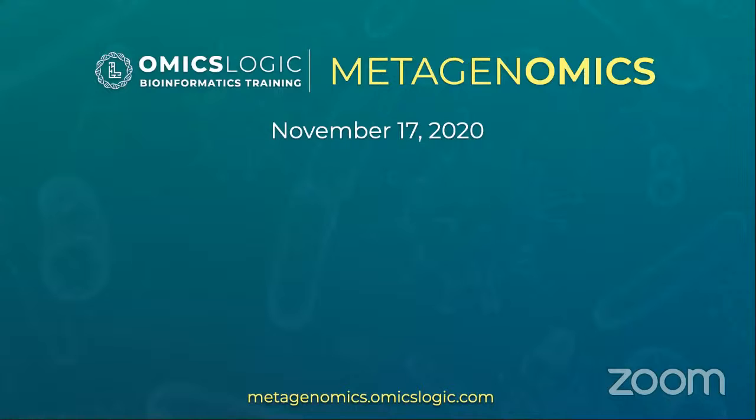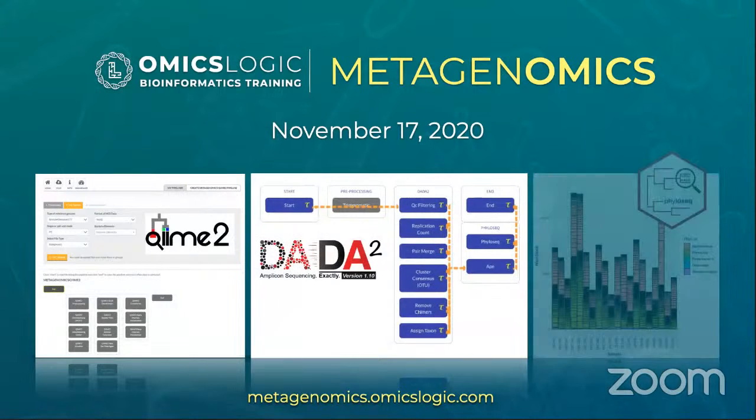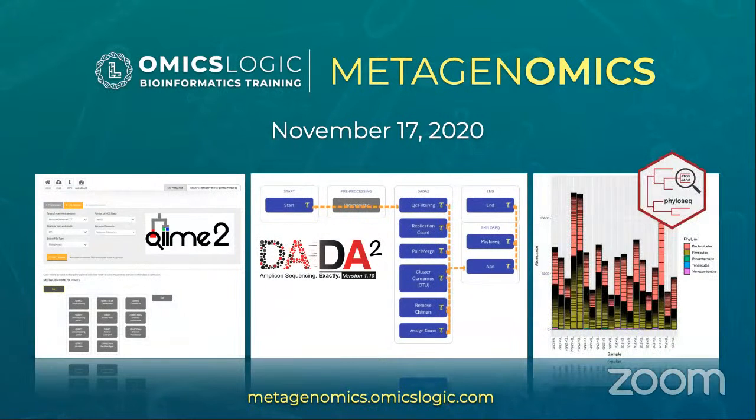So as Deepsa mentioned, in today's session, we're going to talk about metagenomics. What I will be talking to you about is bioinformatics analysis of metagenomic sequencing data. The methods that we'll talk about today include the processing, analysis, and visualization of metagenomics data. We'll talk a little bit about some more detailed tutorials that you will get access to after this session. But today I will just showcase some examples and hopefully you'll find them interesting.